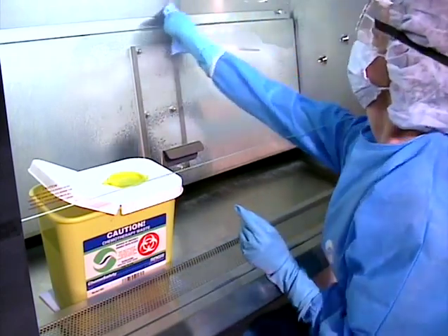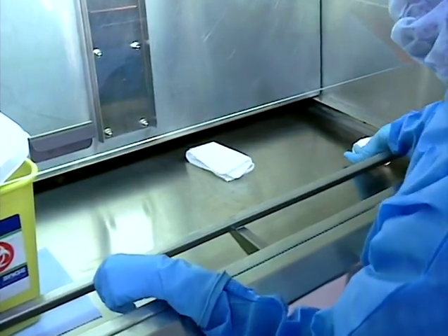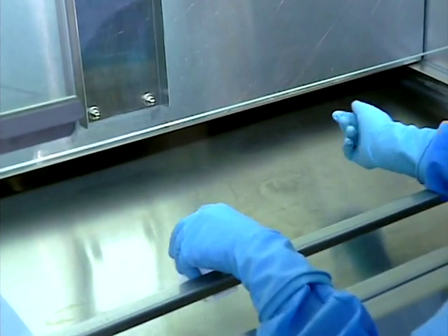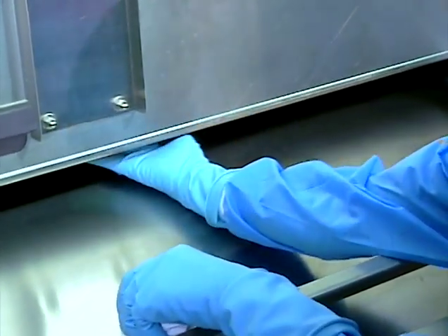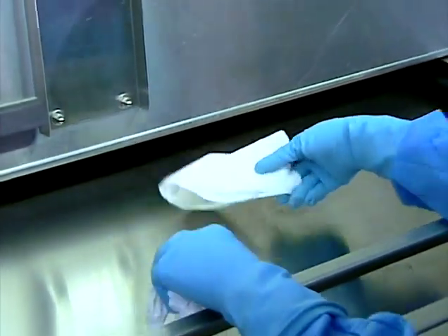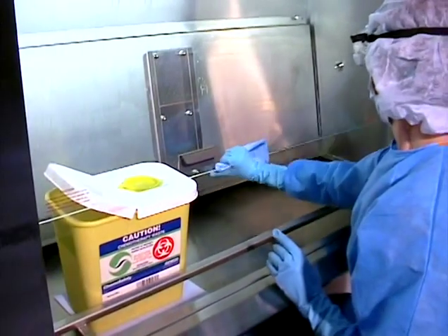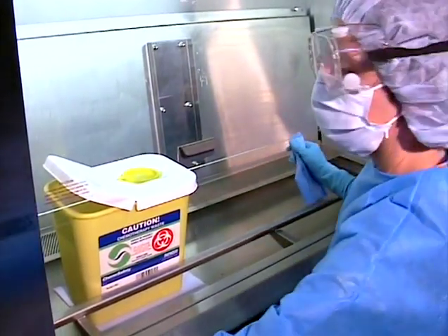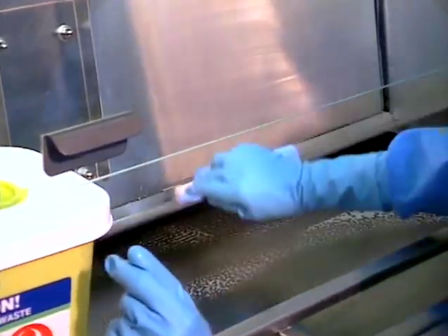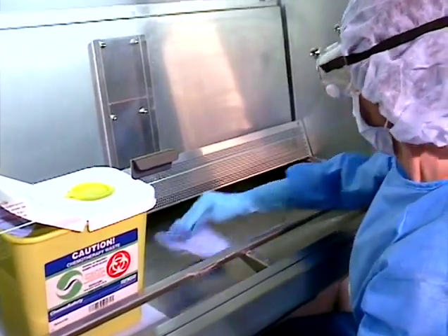In older model hoods, there is no paper catch screen to prevent the aspiration of paper towels and other cleaning materials into the air handler. Be careful not to allow loose towels or other materials to be sucked into the air handler. Modern designs do have a paper catch, which must be periodically cleaned to prevent the obstruction of airflow. Next, clean the back of the front grill and prop it against the work tray. Thoroughly clean the under tray area.